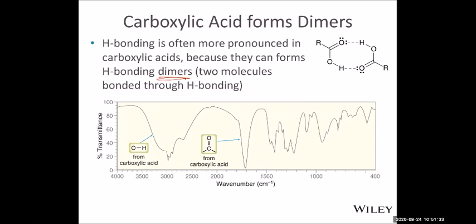So with that, we learned we should be able to predict the infrared: what wave number, what shape for the absorptions. Like we went over, the CH bond and OH bond are above or around 3000 wave number. And the other bond is the carbonyl, CO double bond, around 1700. That's basically what we learned just in this class. The CC double bond also has an absorption around 1600 or below 1600 wave number.